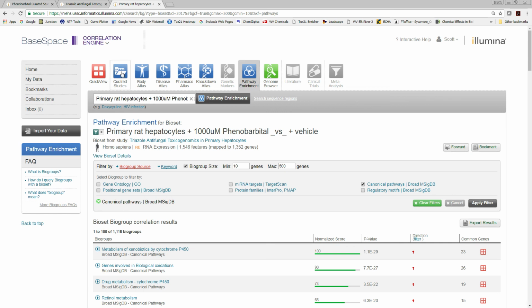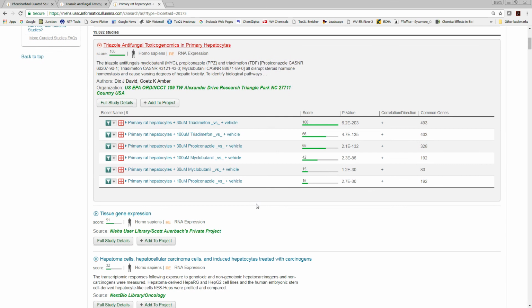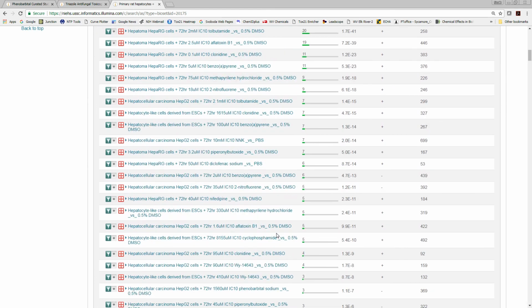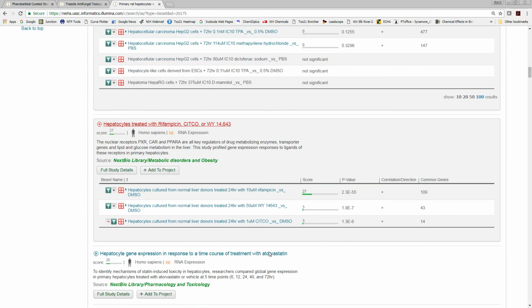But one of the other components that I wanted to highlight in this video is the ability to do meta-analyses. So let's get back here to curated studies. Say I wanted to create a signature for phenobarbital effects in liver. So what I can do is go through here, and hopefully I can identify a couple of phenobarbital treatments. If I cannot, I might have... We'll take Citco. Citco is another CAR activator, so we'll take that one.